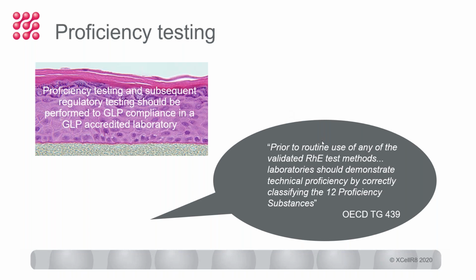So each lab must have demonstrated proficiency in that test beforehand. As in the OECD guidelines, they say that prior to routine use of any of the validated test methods, labs should demonstrate technical proficiency by correctly classifying the 12 proficiency substances, and they are actually listed in the guideline. So next slide, please.